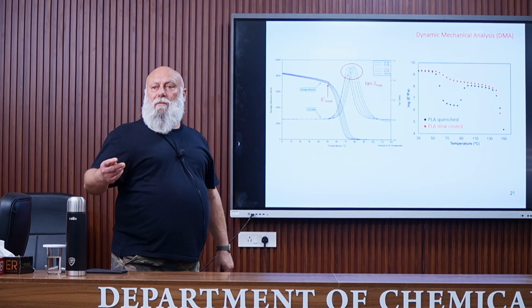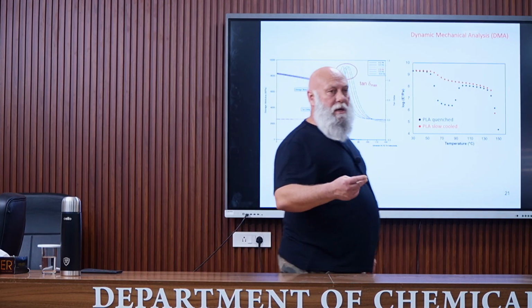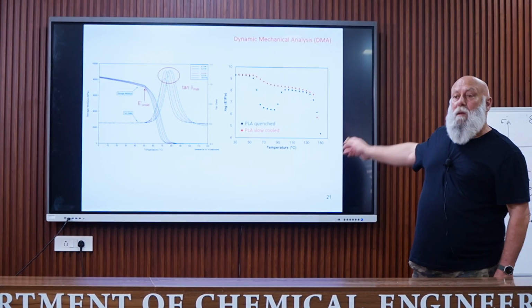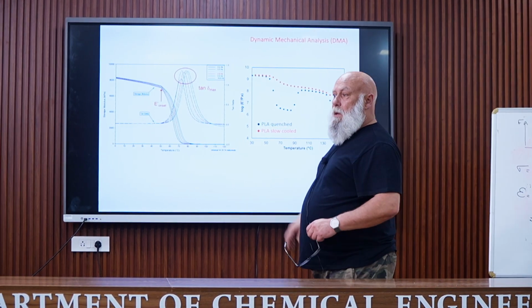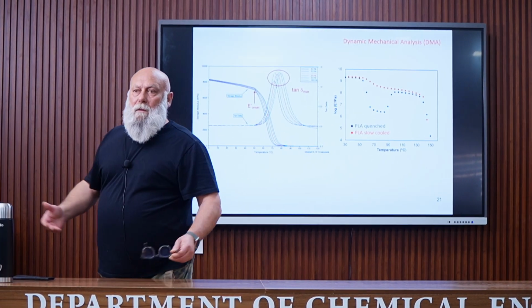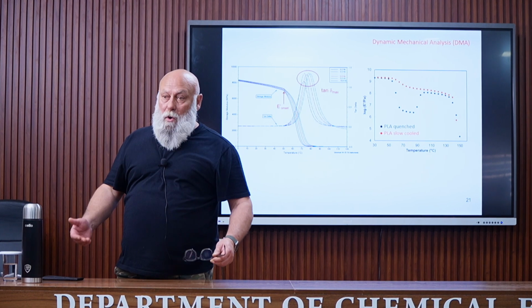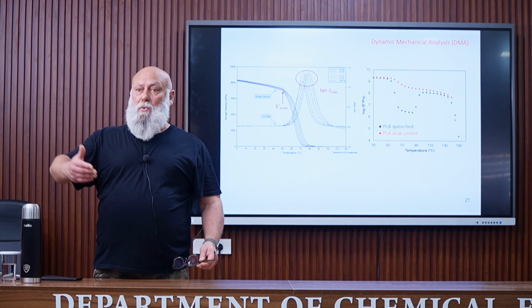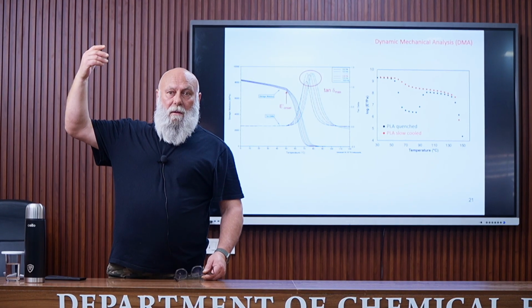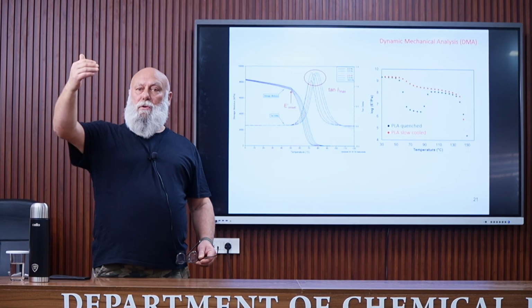There are two reasons for which the modulus of a polymer can increase during heating. Crystallization. Another reason can be the loss of a plasticizer. For example, starch can be plasticized with water, but of course, when heating the polymer, water will evaporate, and because of the loss of plasticizer, the modulus is increased.